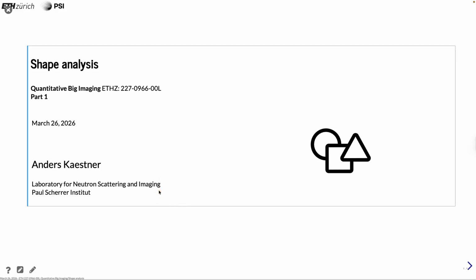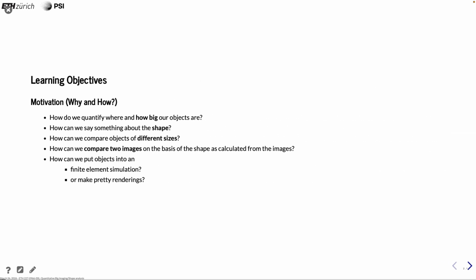So, good morning. Today I'm going to talk about shapes. Now we're actually going towards some kind of structures in the images, which is new. Until now we haven't been really talking about structures, only pixels or groups of pixels. But now we want to know a little bit more what kind of structures we have, how we can describe them, and often we want to know things like how big an object is, or how it's shaped. Could be that it's round, ellipsoid, square, etc.